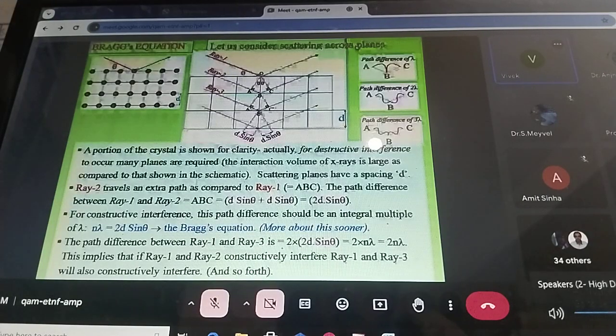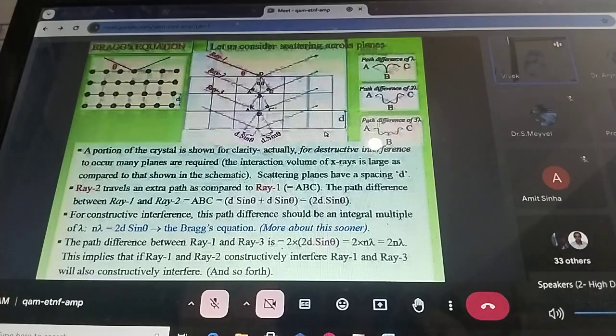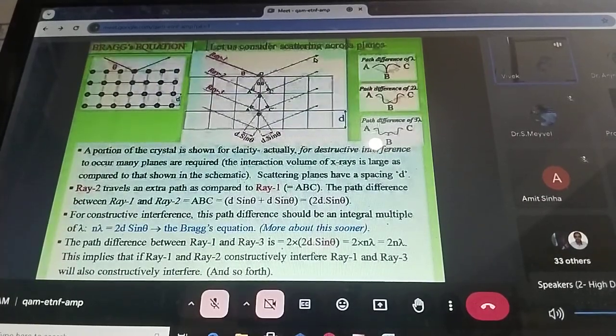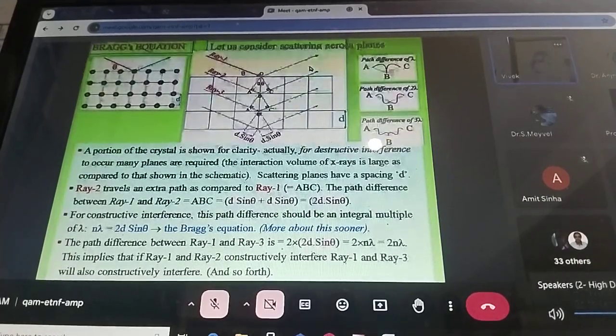So what I mean is that our experiment is simple, an X-ray diffraction study. You take a crystal, mount it, and shoot incident X-rays on it, and whatever information you allow to fall on it, you collect on a photographic film, nowadays on a CCD camera, or whatever be the method, counter method. So all your information is now there.